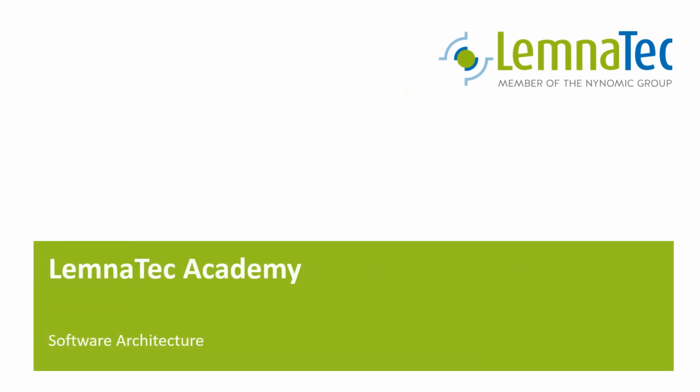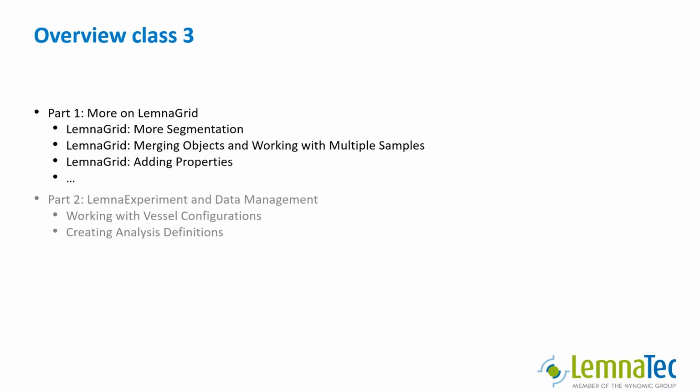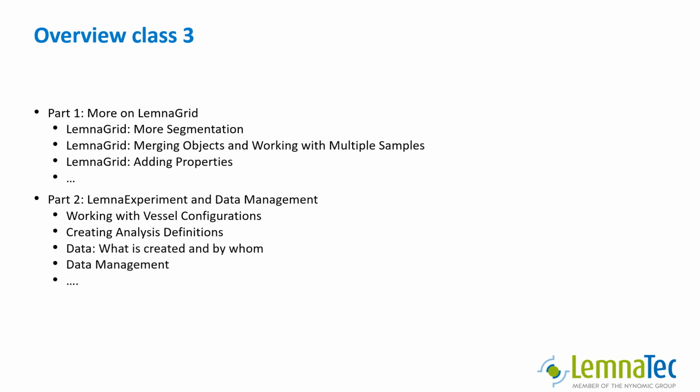With this video, we start into class 3. This class covers various topics around creating analysis code and analysis definitions. In the first part, we will have a deeper look into LemnaGrid. Each of these videos will cover one aspect of image analysis with LemnaGrid. In the second part, I will tell you how to create analysis definitions in LemnaExperiment and how data is handled in general. This includes administrative topics like backup as well. In the future, we will add a third part which explores creating analyses with Lemna 3D.